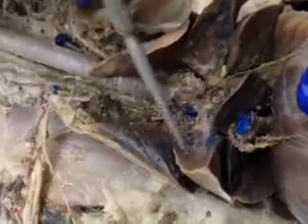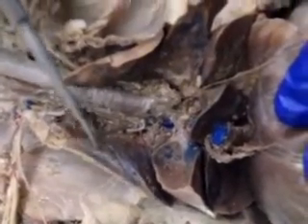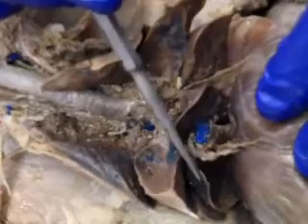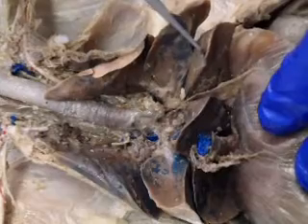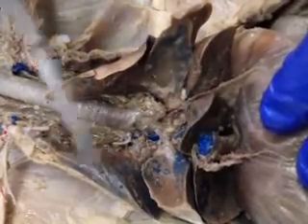All right, so this is looking at the lungs here. And so here we're seeing 1, 2, 3, 1, 2, 3, and then we have one in the middle. So this is the right superior lung lobe, the middle right lung lobe, and this is the right inferior lung lobe. So this is the left superior, left middle, left inferior lung lobe. And then this one is the mediastinal lobe of the lung.